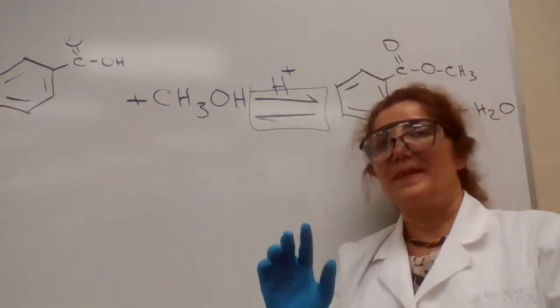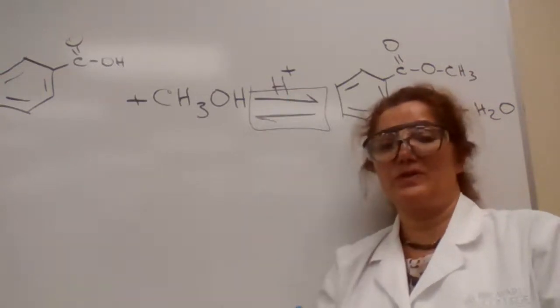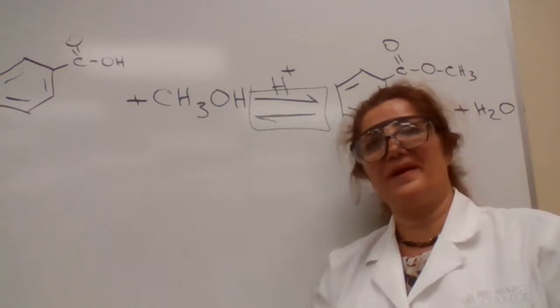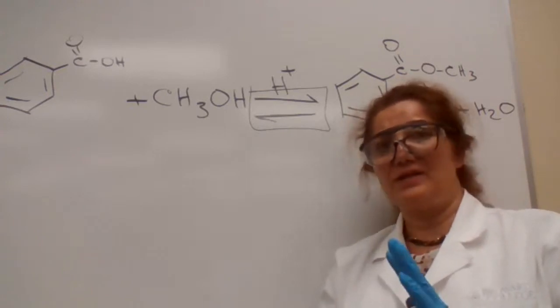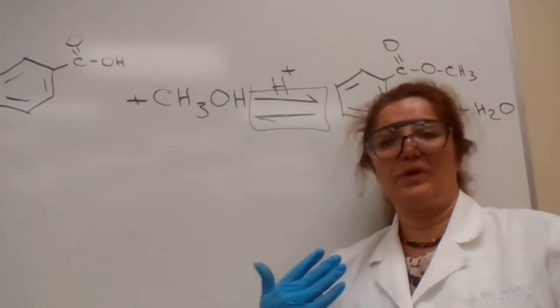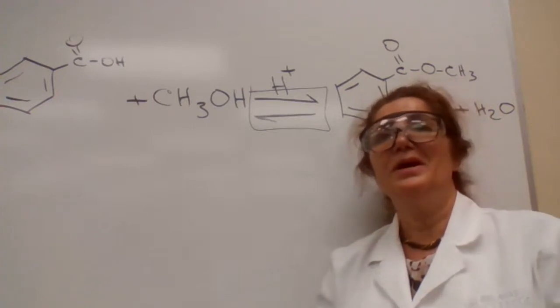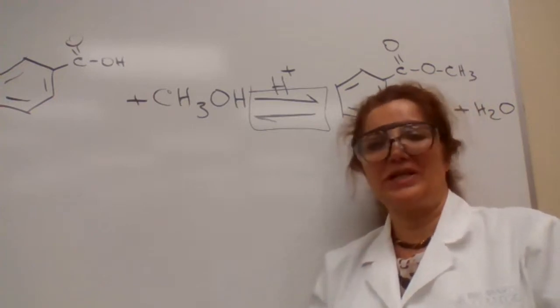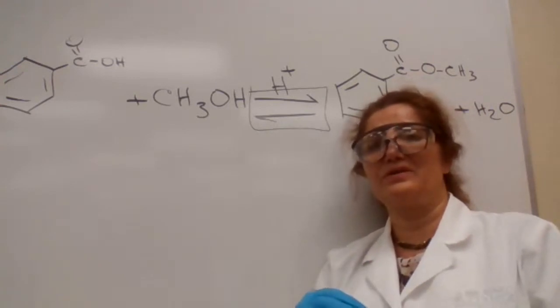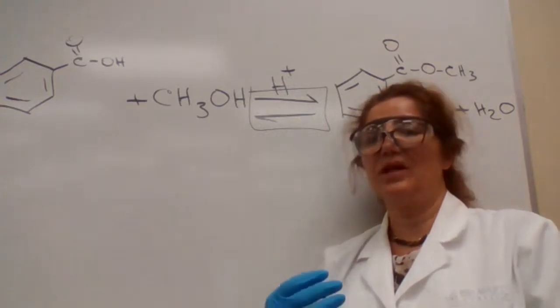top of the condenser. And that's a good thing, because if we see the vapor coming out, that means we are using too much heat, or maybe by mistake the water was turned off and the condenser is not cooling. Or instead of connecting to cold water, you connect to hot water and your condenser is like a heating pad now. Or you are applying too much heat, so you have to lower the setting on the power regulator, and make sure the temperature stays controlled for gentle boiling.